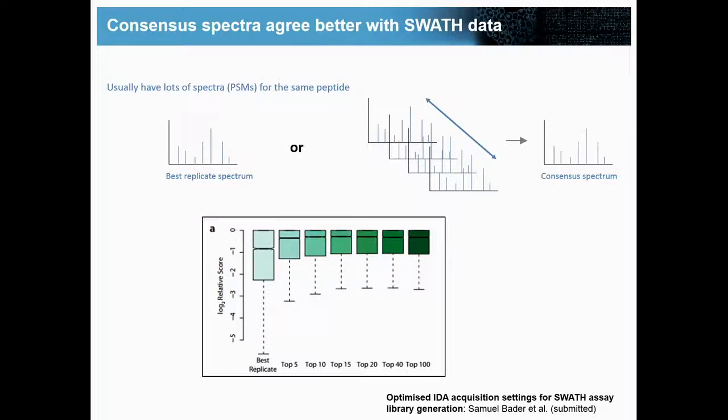Yeah. And I can't see any difference in how. But if we're talking about DDA data though, in DDA data, all you have to go on is this. My guess is that through an algorithm we now pick the best scoring spectrum and then the most intense, and so there's a whole rationale to it. The original best spectrum algorithm was just to do an all versus all and pick the thing that matched everything as well as it could possibly match.